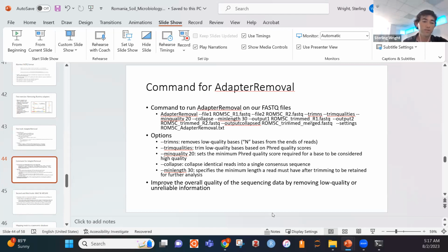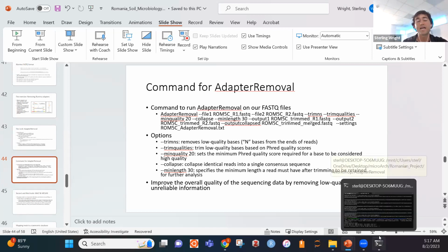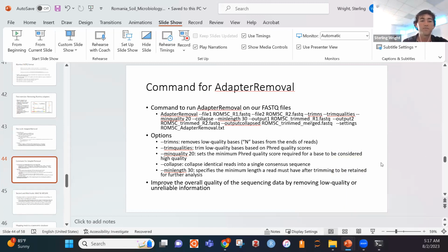You can do it that way too. And if these samples are actually, I skipped the demultiplexing part. So sometimes you also want to do the barcode list and do that demultiplexing stuff. In that case, you'll have to have that. But in this adapter removing step, you don't actually have to have the adapters. It can actually identify them for you.